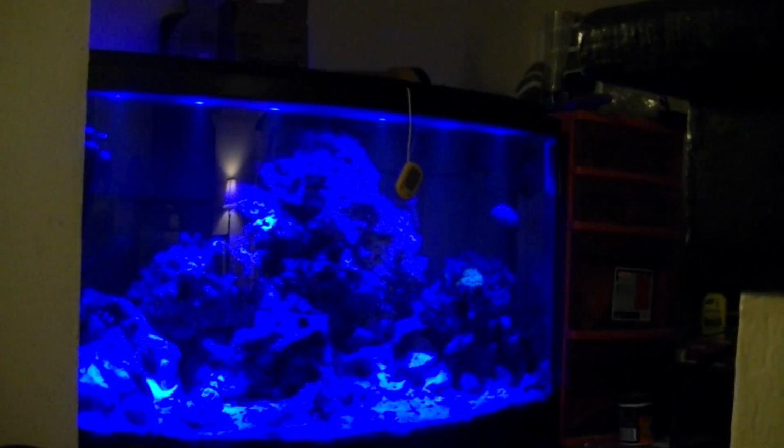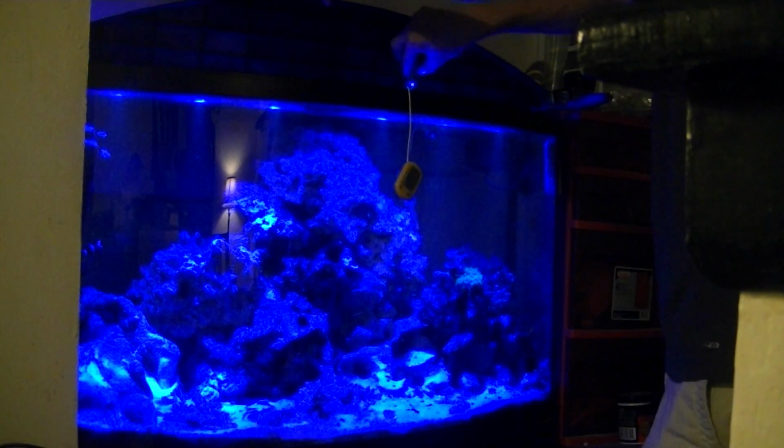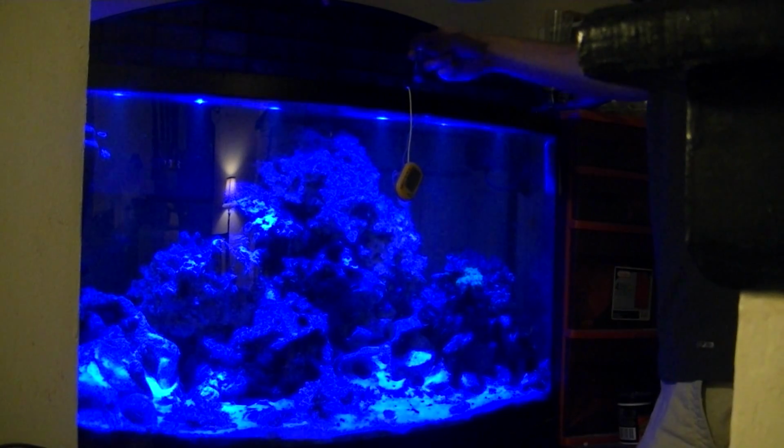What we do with this is we take one vial. I'm going to rinse it out in the tank water. So I'm going to go ahead and do that. And then I'm going to fill it up with 5 milliliters of liquid itself. You just rinse it out first a couple times so it's only got tank water in it, nothing else. And then it's got a line on it. You fill it up to right about where the line is.